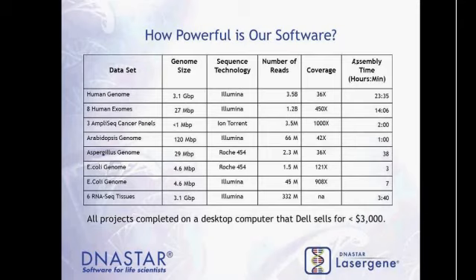So this includes things like doing all the statistical SNP analysis and generating all the SNP files, doing GERP calculations. And we produce a BAM file output that contains a whole host of accessory files that makes analysis of this genome a lot more efficient and a lot easier than if you just had a plain BAM file. So we're doing a lot in this 23.5 hours here.